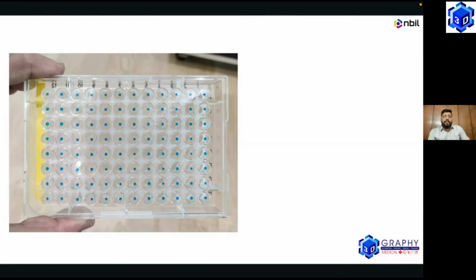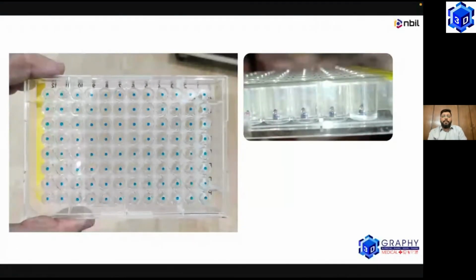Now, with this, obviously, the control that we were getting in each system was improved, and we thought the project was good. They were happy. Now, the next phase, we didn't know, they threw a curveball at us, where they said, okay, you print one drop, and I want you to print another drop exactly on top of that drop.